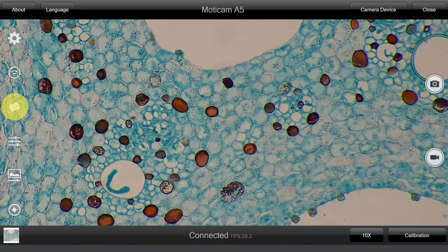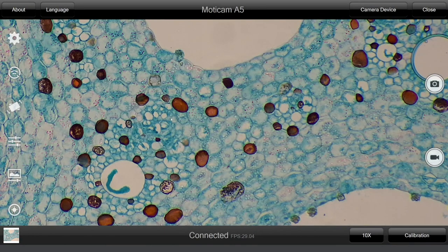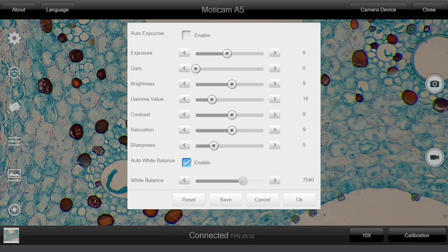Mirror and flip your images using the image transform option. By selecting the following icon you will be able to adjust parameters such as exposure, gain and white balance. You can choose to do this automatically or manually, whichever suits your needs best.